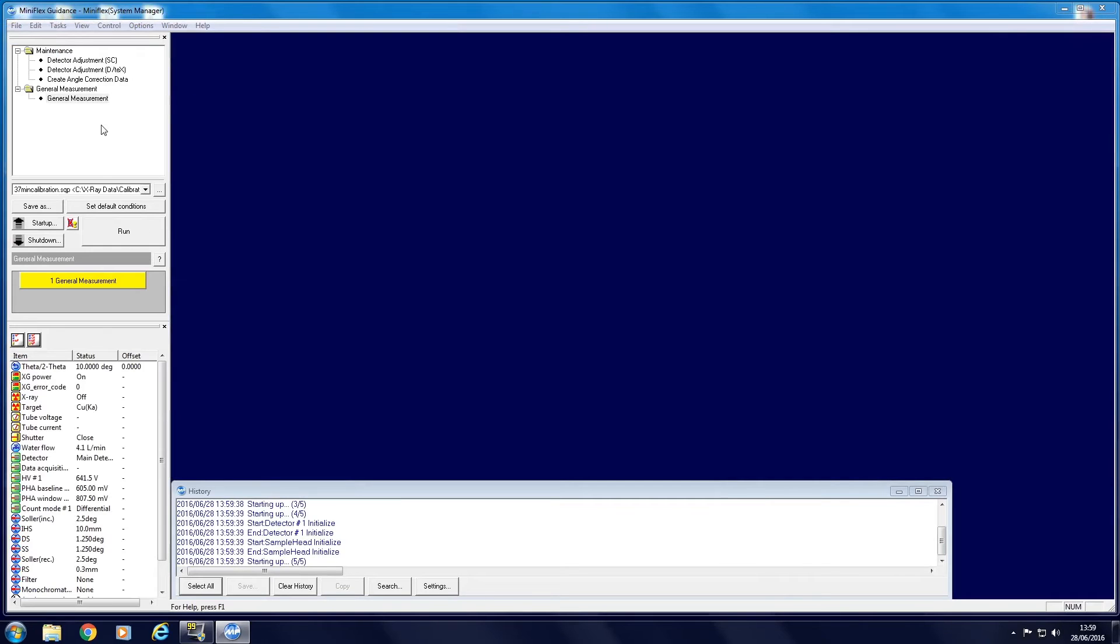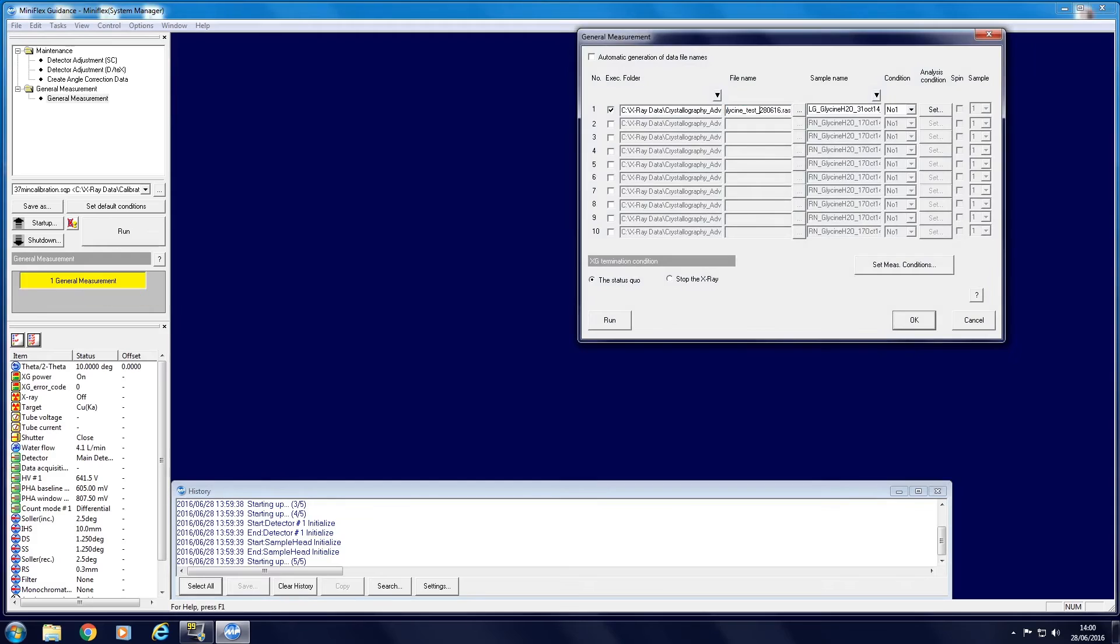To collect a pattern, click the yellow General Measurement button. This will bring up a new window, in which you can choose a name and directory for your data to be saved.